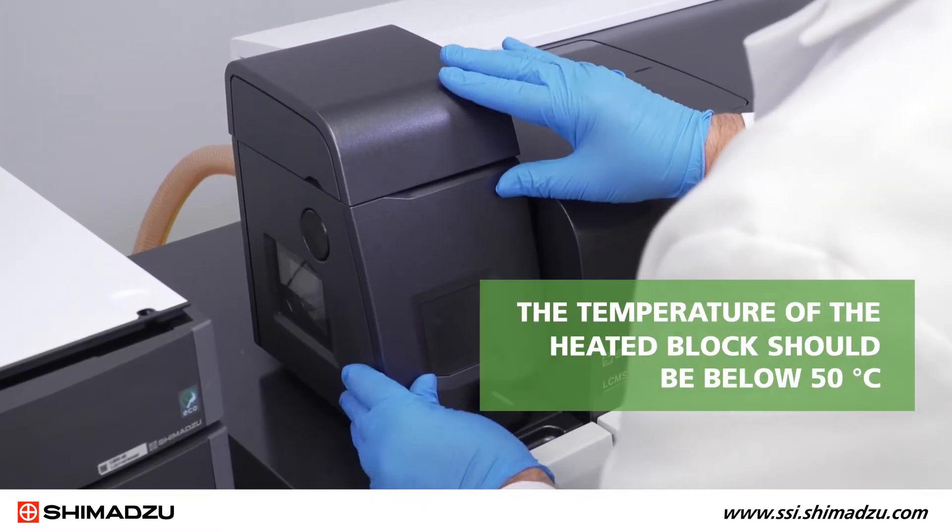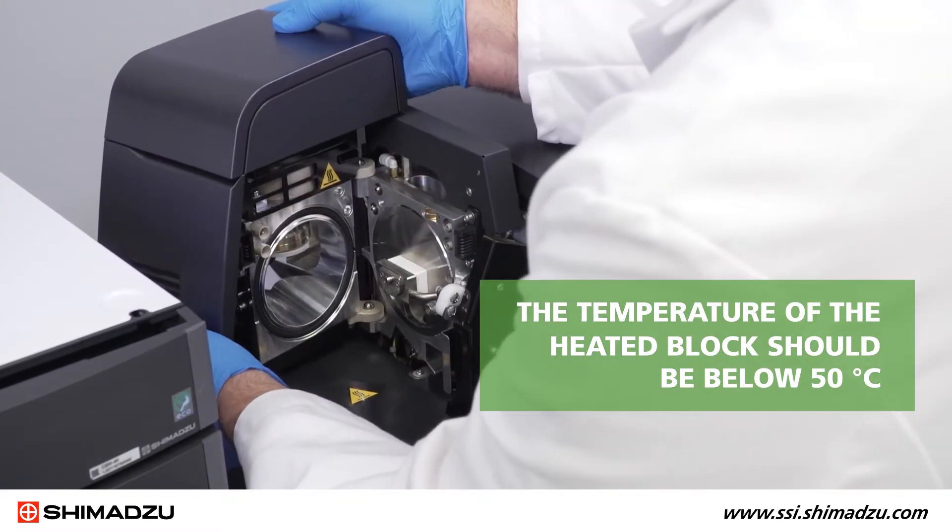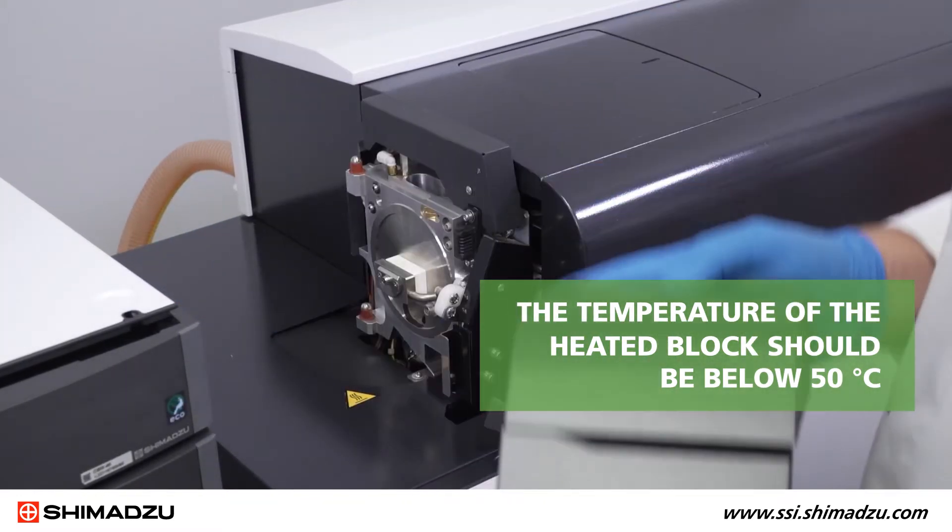To avoid injury, the temperature of the heated block should be below 50 degrees Celsius before you remove the unit.